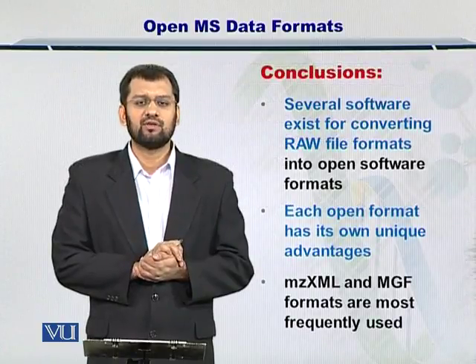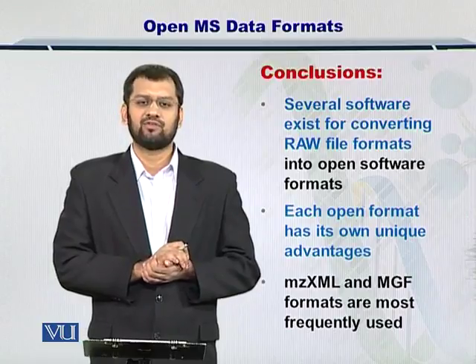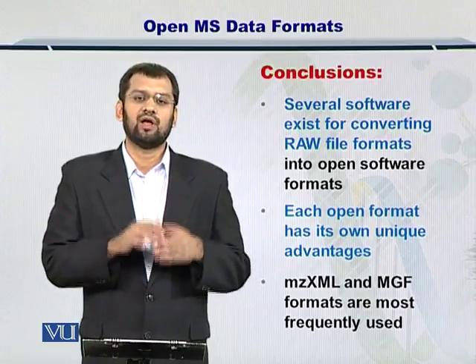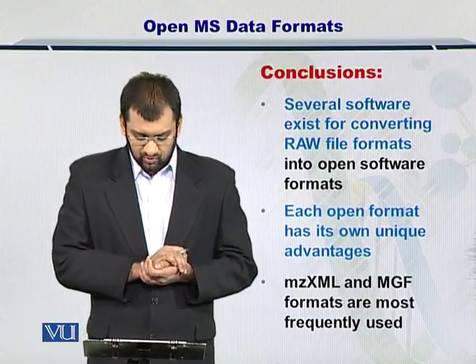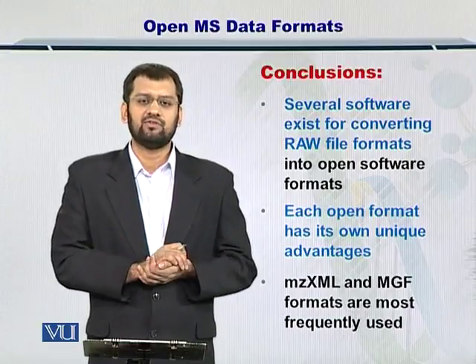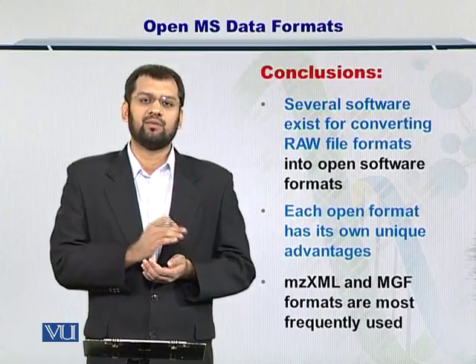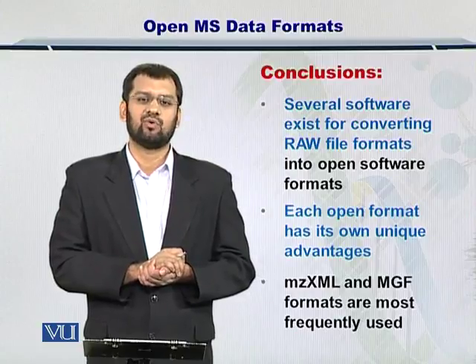In conclusion, several file formats exist as open file formats, and you can choose the one which you like, and you can write your algorithms by using those file formats. More so, MZ-XML and MGF are the leaders in open file formats, and therefore are the most prevalent and the most employed by bioinformaticians all over the world.